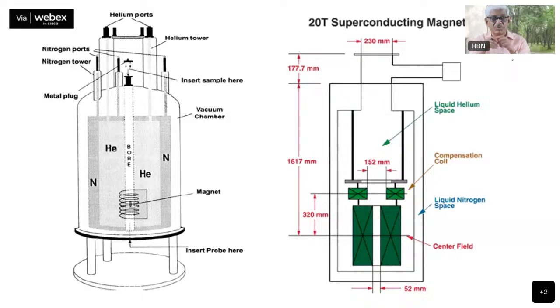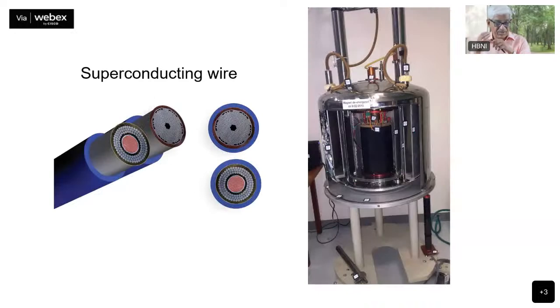So in order to increase the number of turns, the field generated overall depends on the total number of turns in the coil. And this is enhanced by a special design of these coils, superconducting coils. And that also we showed here, how the highly technologically very precise system of making the superconducting wire. So many superconducting wires are drilled into one particular copper wire, and the current essentially flows through the superconducting wires only. It doesn't go through the copper because the copper has the resistance and superconducting wire don't have resistance, and therefore the current will flow naturally through the superconducting wires.